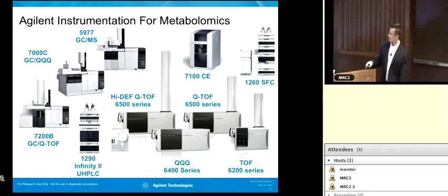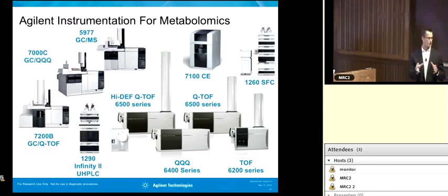So if we step back now and look at this more globally, we've zoomed in and seen some of the nodes, the quilt plots, and fractional labeling. Now if we splatter it all on here at once, we can see our pathway. We did the data analysis and created our pathway using Omics Premium, loading in content from KEGG, or maybe BioCyc.